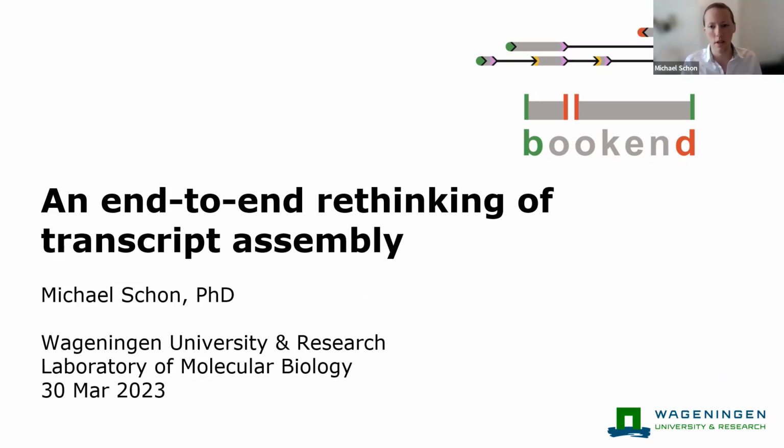My specialty really is in developing both molecular and bioinformatic protocols for getting the best picture possible of RNA at the isoform level. And so I want to thank LEXOGEN for inviting me to perform this webinar, and it will be sort of in two parts. First, I'd like to talk about how we got to the present day, sort of RNA sequencing technologies up to now, and then I'd like to introduce my own software package I've been developing and sort of the ideas behind it and how it performs.